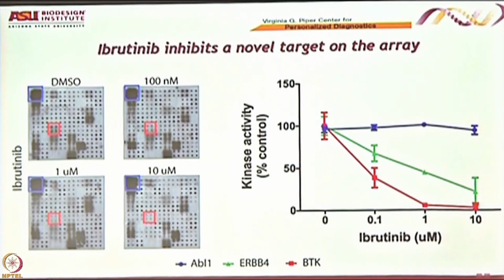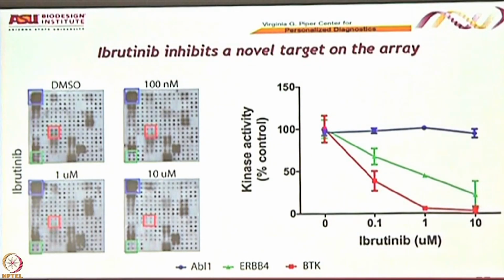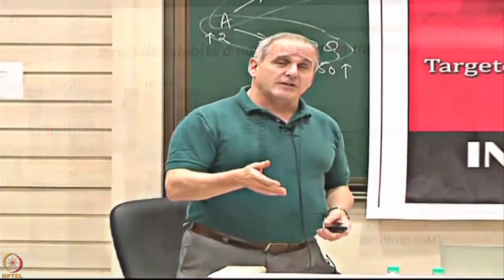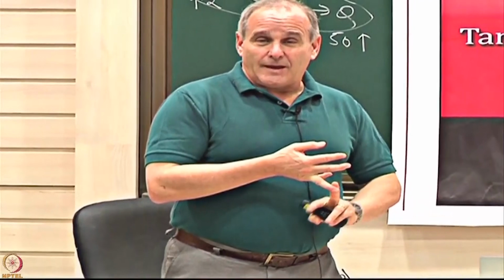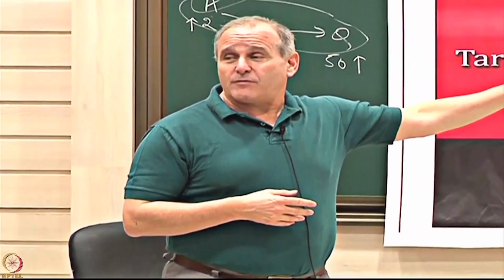And then what Fernanda noticed by carefully reviewing these slides was this guy down here. Strong signal over here, weaker signal there, and weaker still over here. And lo and behold, that protein turned out to be ERBB4. That was pretty exciting, because if you think about it, the ERB family, right, so EGFR receptor, ERBB2, HER2/neu, those are 2 of the most prominently known oncogenes in all of cancer studies, right? There are very, very successful drugs against both EGFR and ERBB2. And now we found a drug against ERBB4.